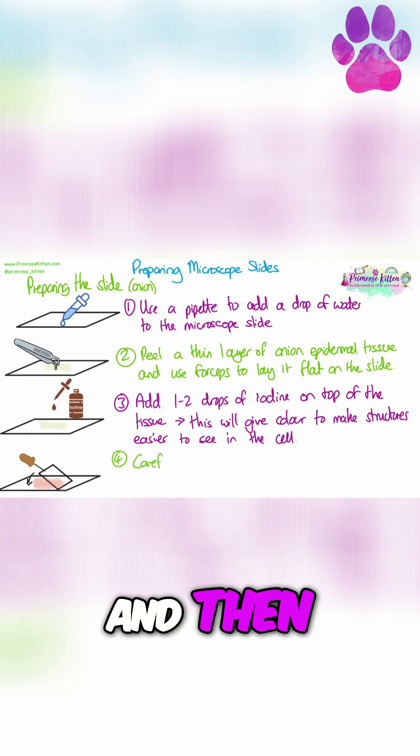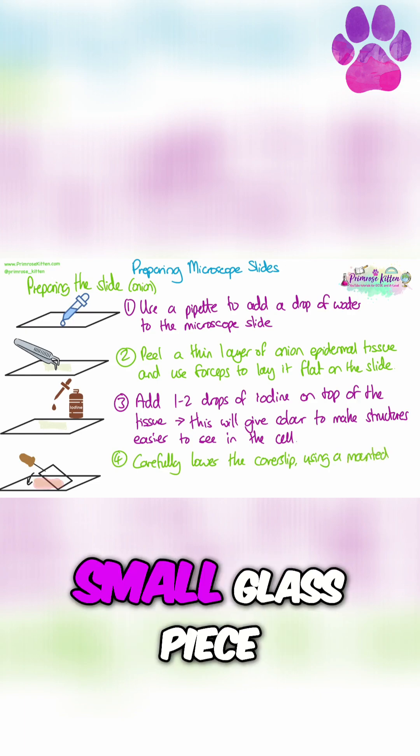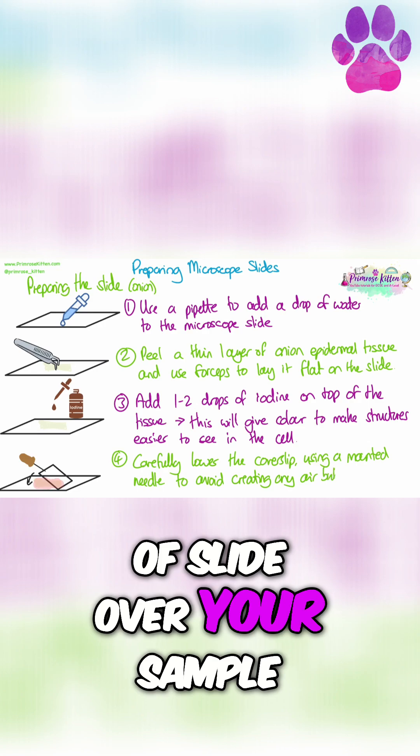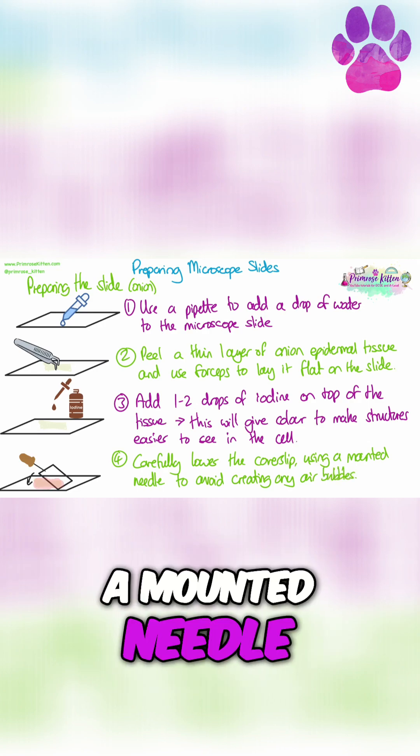And then finally, you're going to lower your coverslip, which is again a small glass piece of slide, over your sample, and you're going to lower it down using a mounted needle.